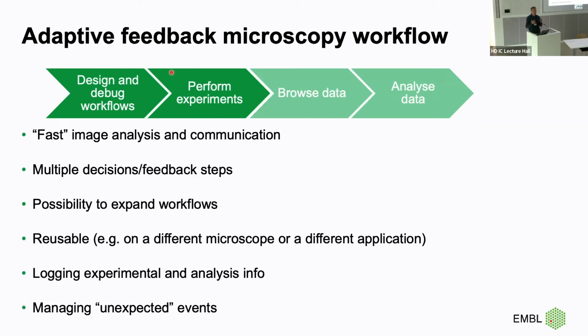We want to make workflows of certain kinds reusable, right? So if people, instead of selecting one phenotype, select another phenotype, but they want to always bleach, they should not need to rebuild the entire tool. So we as a facility are interested in having reusable workflows, and sometimes also transferable to other microscopes, maybe of a different brand. We want to log all the experimental info because if I run an experiment overnight or over days and I come afterwards and something didn't work, I want to know what didn't work, right?